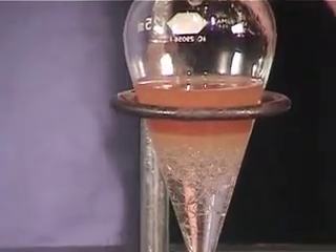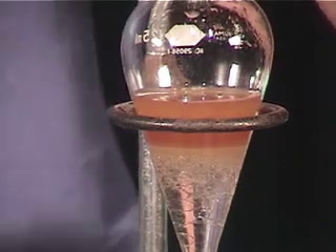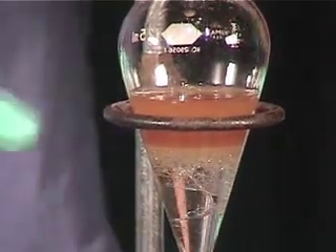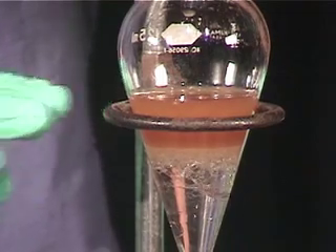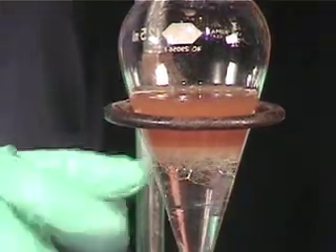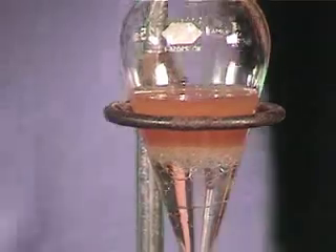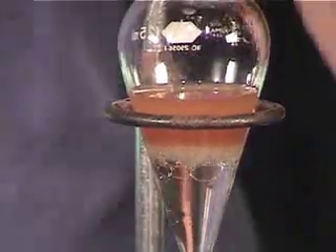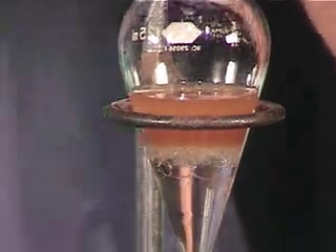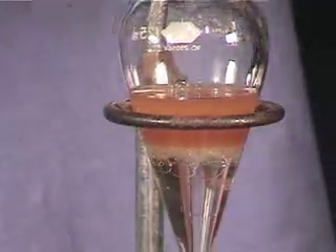A very serious emulsion happens when the two layers don't separate at all. What happens is you'll get a solution that looks very, very milky between the two layers. You can actually see a slight emulsion between the two layers here — those bubbles at the interface between the two layers. This does not seem to want to separate.